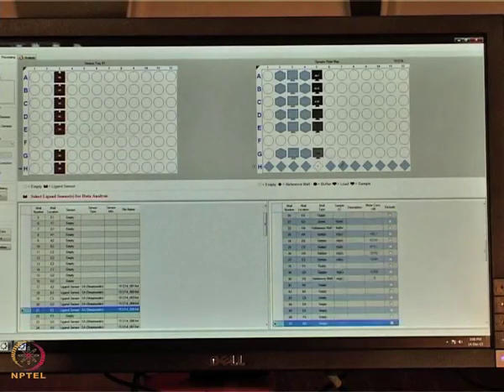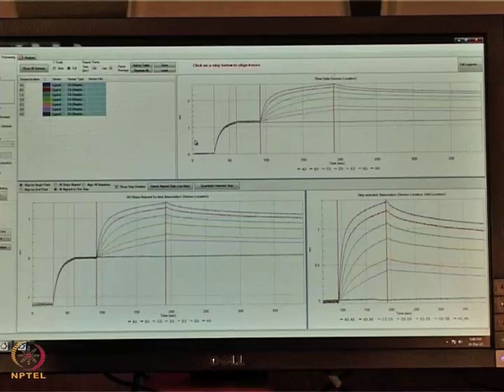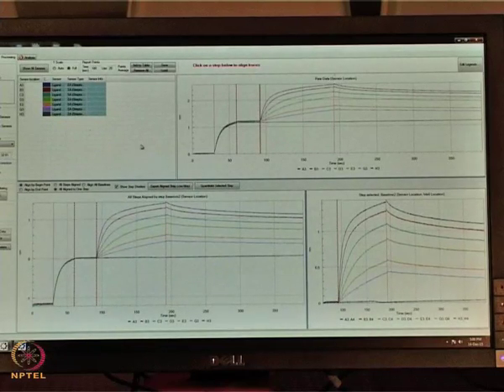So I am using here just a 0 constant for the subtraction. For the reference well I am going for that. In the raw data I will select this association step. Then there is the Y align, Y axis. I am going to do a baseline. This is the baseline step, and for this particular baseline I am going to align.